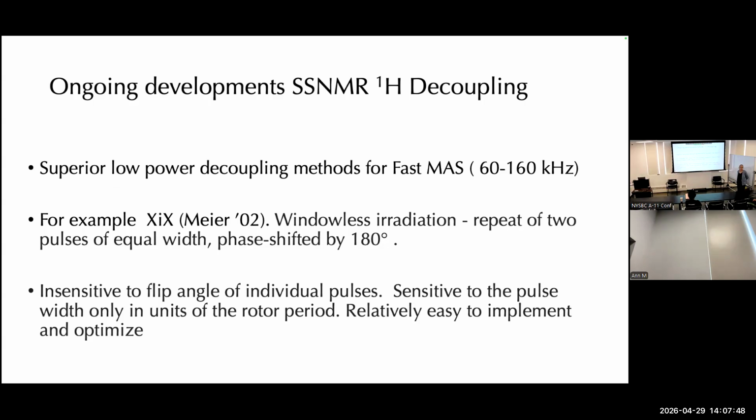And would that even cover your spectroscopy? Yeah, that's a good question. So if I'm spinning at 60 kilohertz and I say my omega 1 is weak, what am I saying? 10 kilohertz, 15 kilohertz? And carbon, what is my spectral width? So those pulses at face value are not going to cover my carbon. Actually, we've been talking about proton decoupling, so we need to cover the proton spectrum.